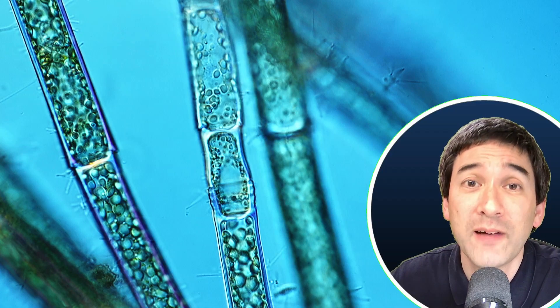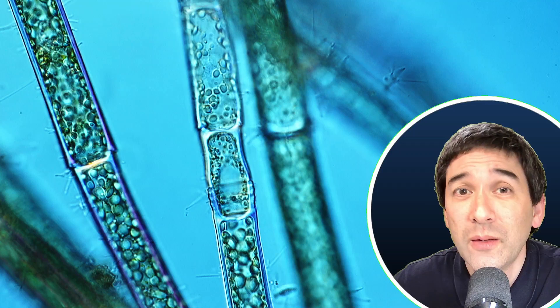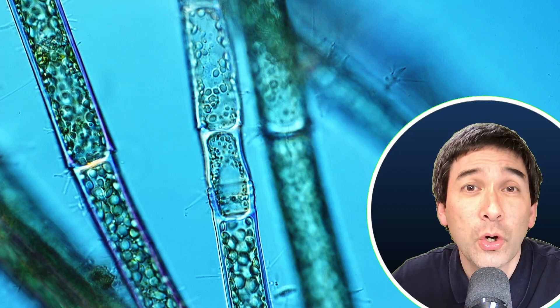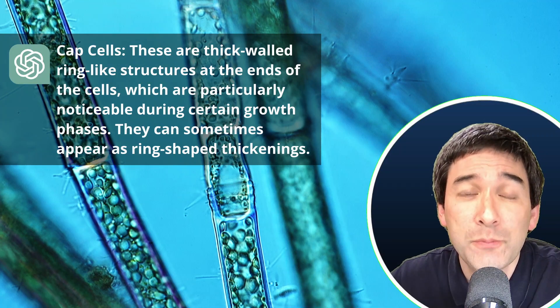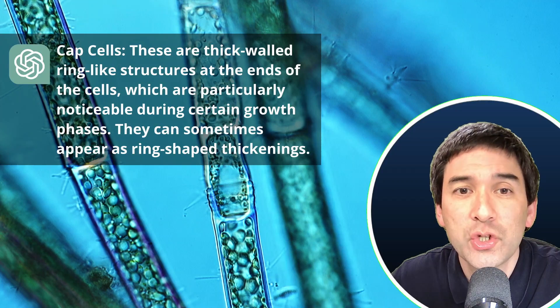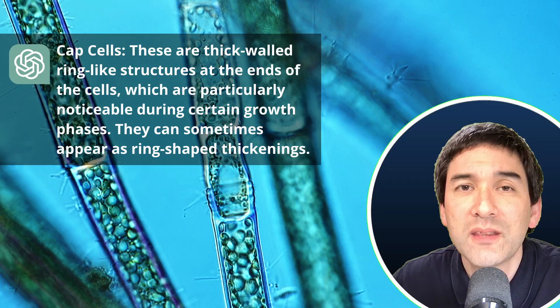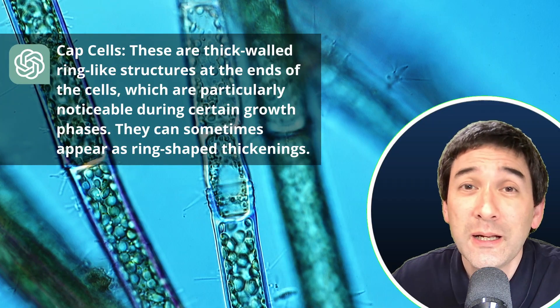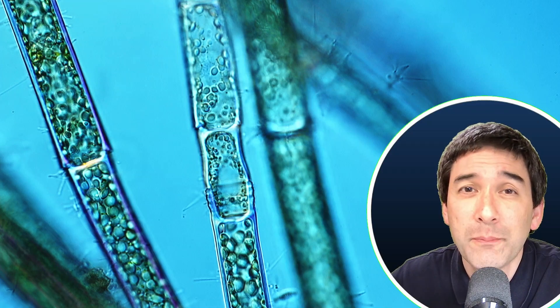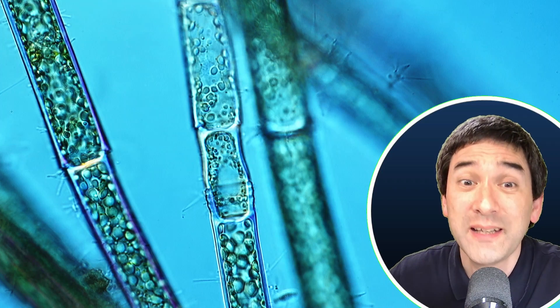Then using a picture search, I found algae that contain those interesting ring-shaped structures, which are thickenings of the cell wall. And they have even a specific name. They are called cap cells. And this is also what ChatGPT told me. These are thick-walled ring-like structures at the ends of the cells, which are particularly noticeable during certain growth phases. They can sometimes appear as ring-shaped thickenings. And they're basically a leftover from cell division. The process is a little bit complex in cell division of this algae here. And these are basically thickenings that are kind of leftovers or remnants of cell division. So I've identified it.